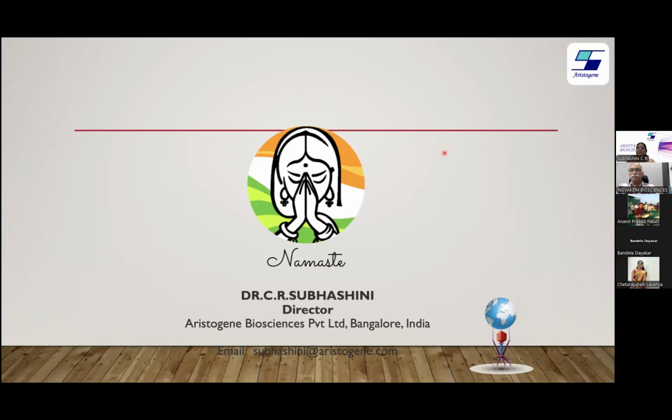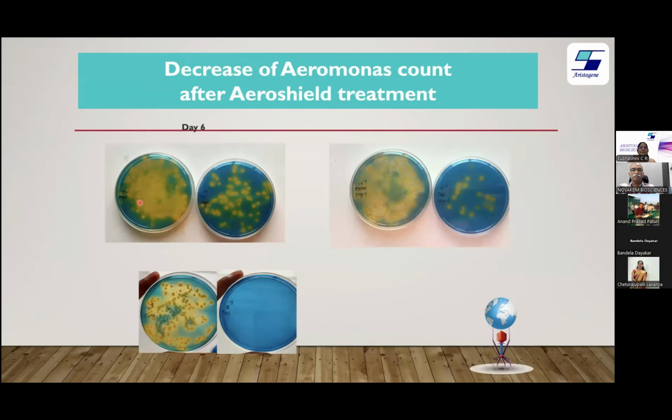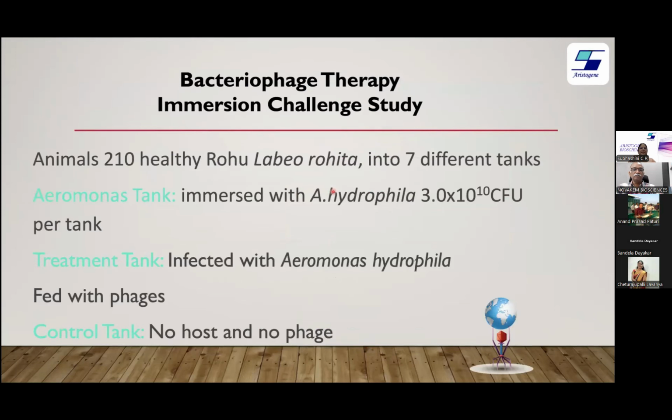Thank you. Madam, at what concentration of bacteriophages have we used for challenge studies? See here, I think 10 power 9 CFU per gram. Per tank, I think these are around 15 liter or 20 liter tanks, so I need to reconfirm that. We have used 3 into 10 power 10 CFU per tank. Normally in a challenge study we at least use 1 MOI, that is 1 multiplicity of infection. For every bacteria, that is 1 bacteriophage. So that is the level which we have added.